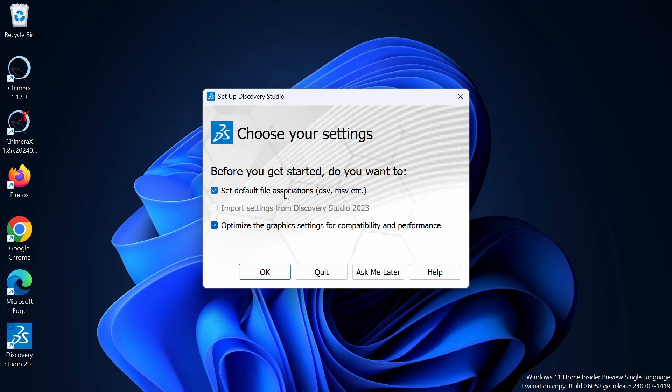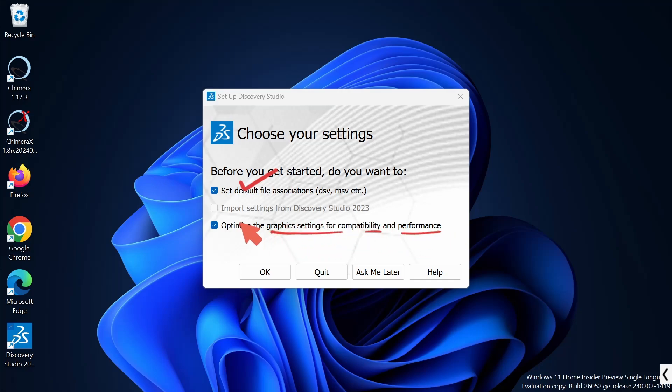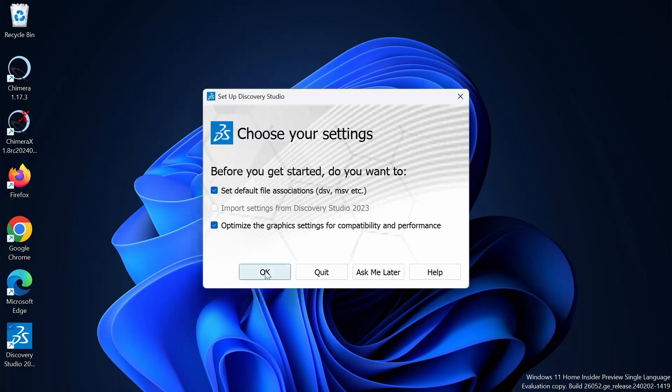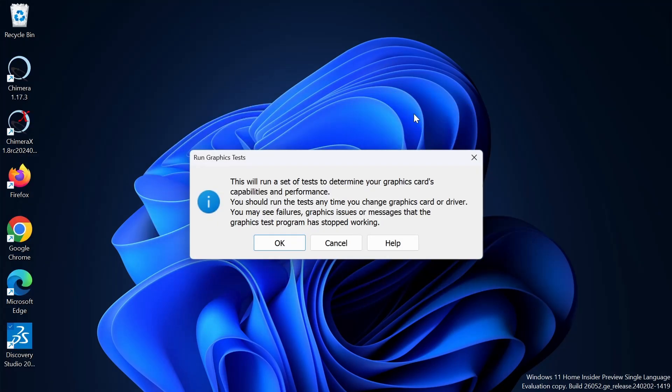Before you get started, you want to check some of the options. I'm going to set the default file associations, that is DSV, MSV, etc. And I'm going to optimize the graphics settings for compatibility and performance also. If you have older versions, that is Discovery Studio 2023, you can check this box also. So I'm going to click on OK.